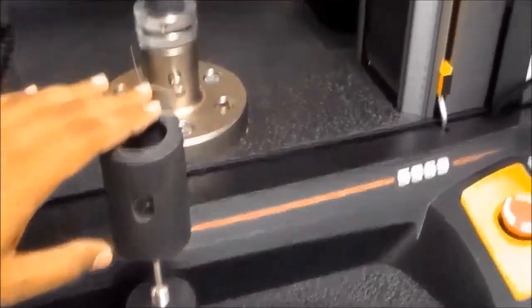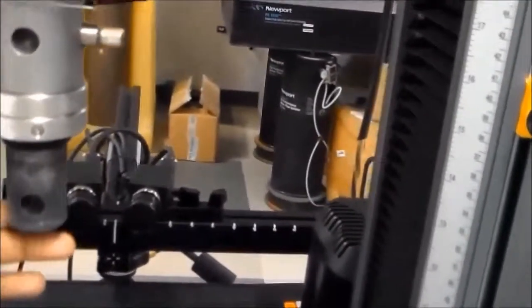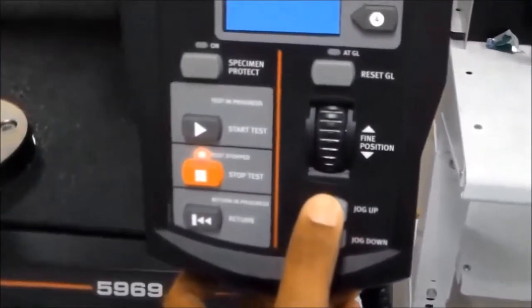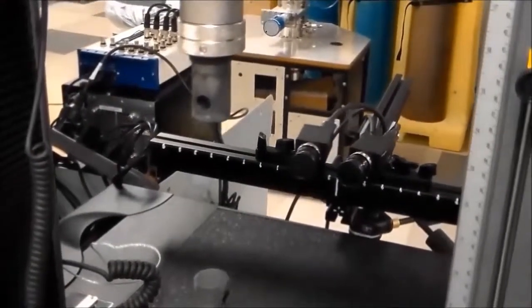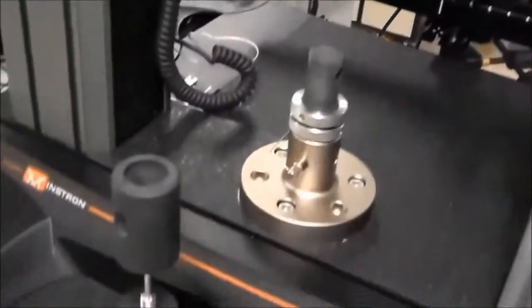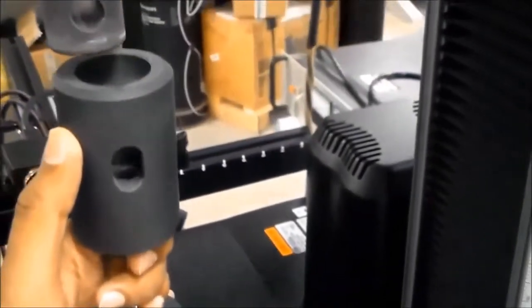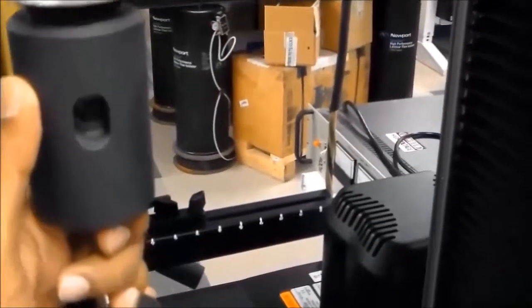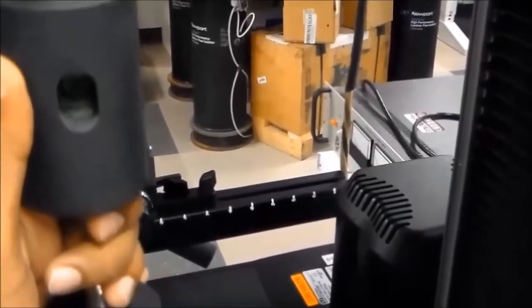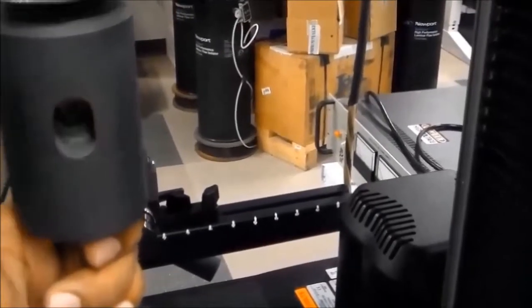Before loading the grip and specimen to the system, press the up button to move the upper portion far enough to fit the grips. Always start by mounting the grip to the upper part first — the hole should align so the pin goes through to lock it.